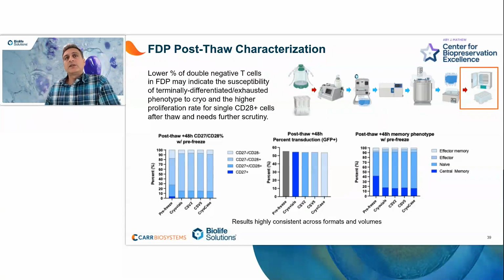the CD4-CD8 ratio. Nonetheless, there was no impact on the transduction or GFP positive cells as we tested it in a GFP lentivirus. One thing we see is the identical response from all the different formats and different volumes that we froze in this experiment, which is very encouraging.